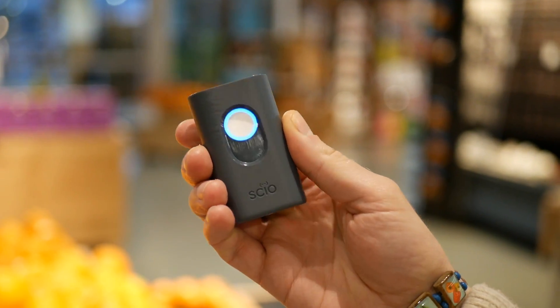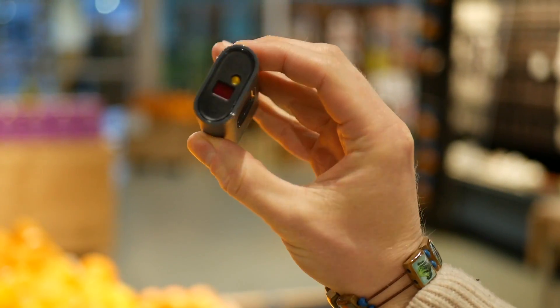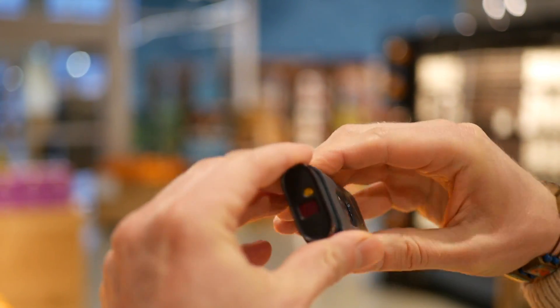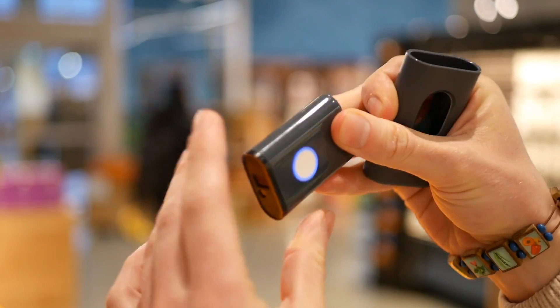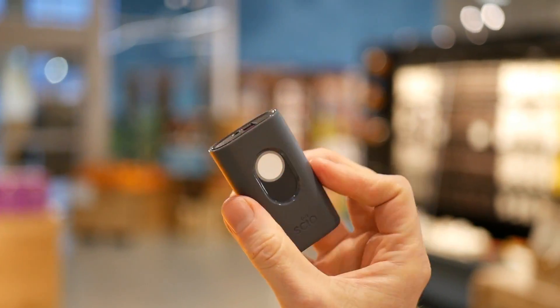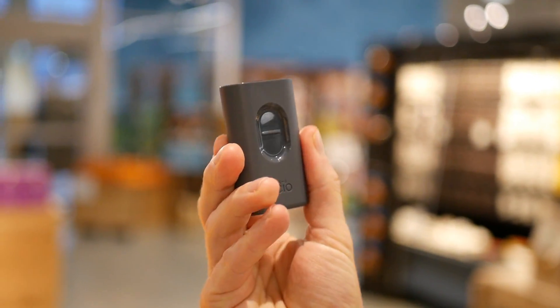The application that you download on your phone is made by those guys as well. You can buy a certain version of the application that allows developers to create other apps and make this molecular sensor more universal for very different applications that these super smart tech guys and girls might think about. Really cool, funky toy slash educational tool — in places like Whole Foods here, I'm very excited to go around scanning different stuff at home as well.